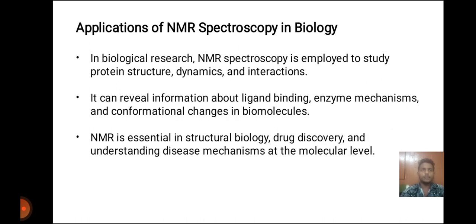Application of NMR spectroscopy in biology. In biological research, NMR spectroscopy is employed to study protein structure, dynamics, and interactions. It can reveal information about ligand binding, enzyme mechanism, and conformational changes in biomolecules. NMR is essential in structural biology, drug discovery, and understanding disease mechanisms at the molecular level.